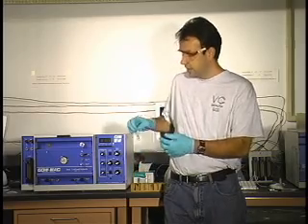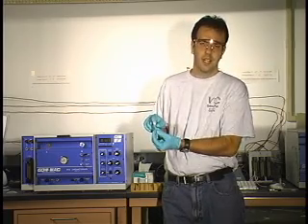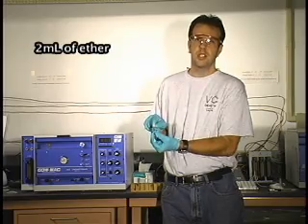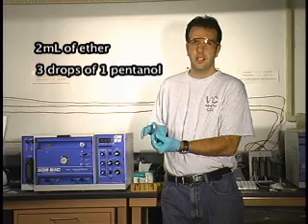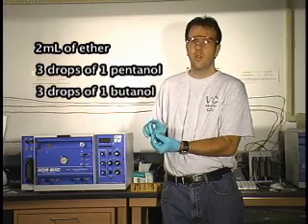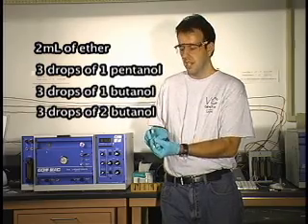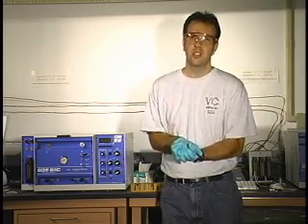This week you're going to be simply learning how to use an instrument by separating three different alcohols. You want to make sure that you keep it closed after you prepare it. This solution contains two milliliters of ether, three drops of one-pentanol, three drops of one-butanol, and three drops of two-butanol. We're going to use this and learn how to use the instrument.